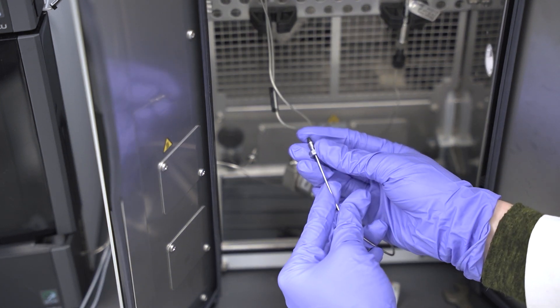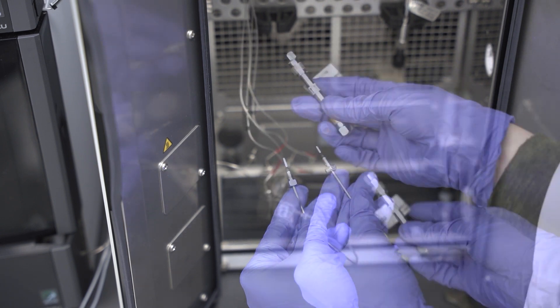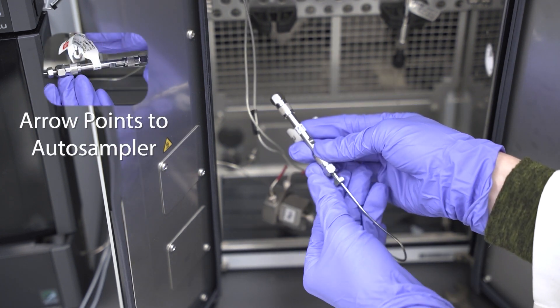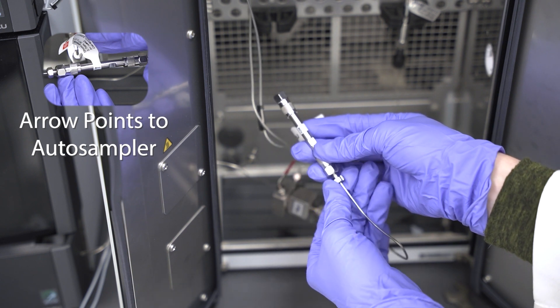The flow direction of the column should match the direction of the solvents used for the LC system. Confirm that the arrow showing the flow direction points towards the auto sampler.